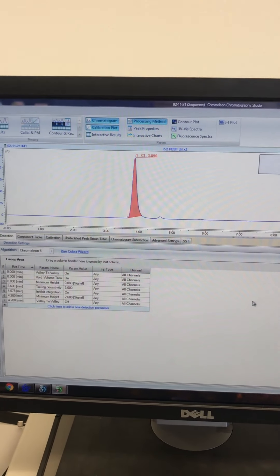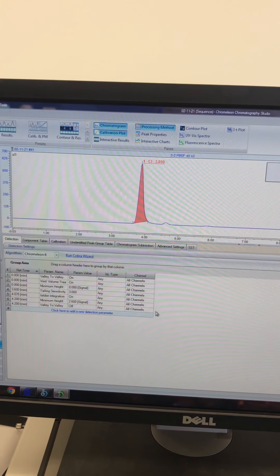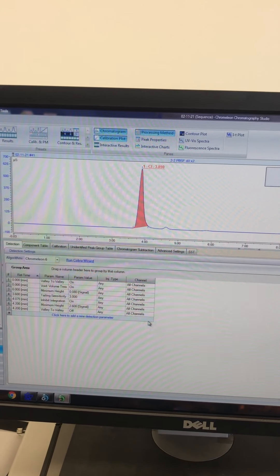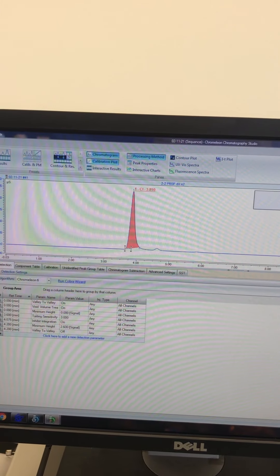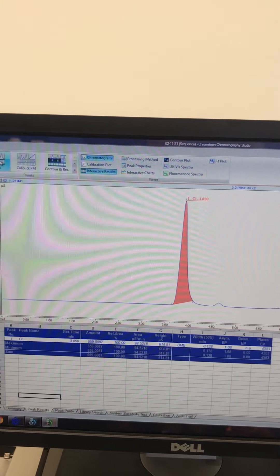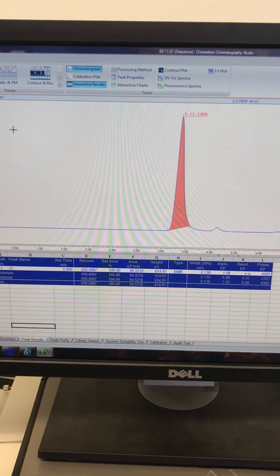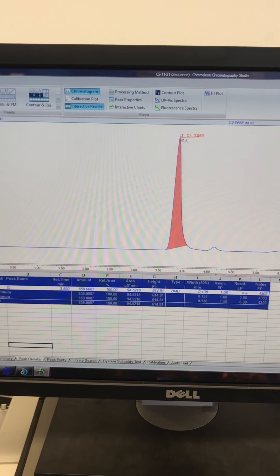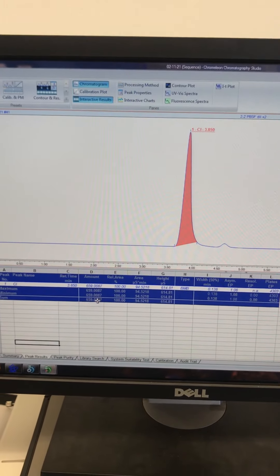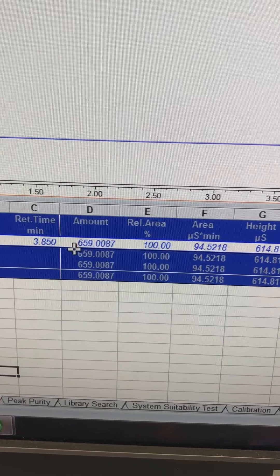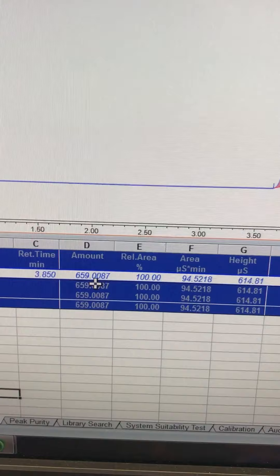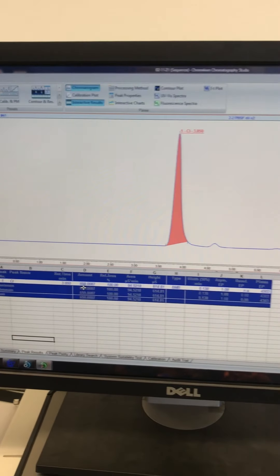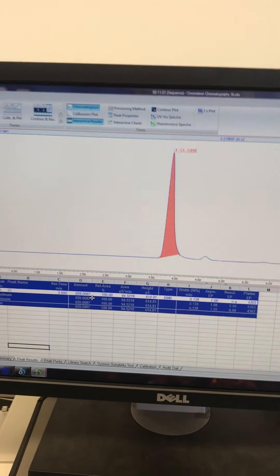This is what a result looks like. It uses these series of procedures, which I'm able to change and specify as needed, to calculate the area underneath this curve. The result is this nice table here that tells us the chloride concentration in our water sample. Our sample from Pheasant Branch Creek had 659.01 milligrams per liter of chloride. That's really high, but it's not unexpected for that creek.